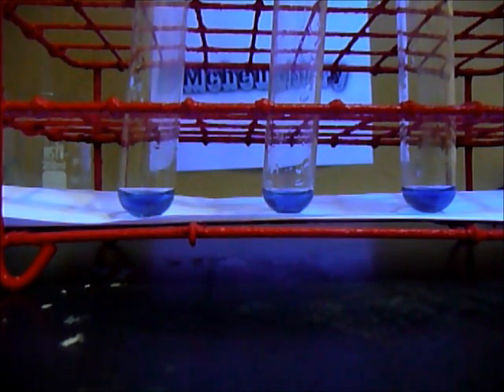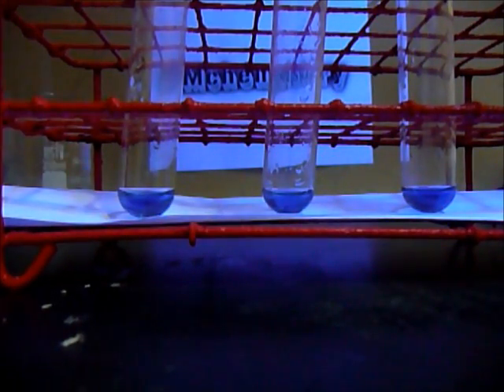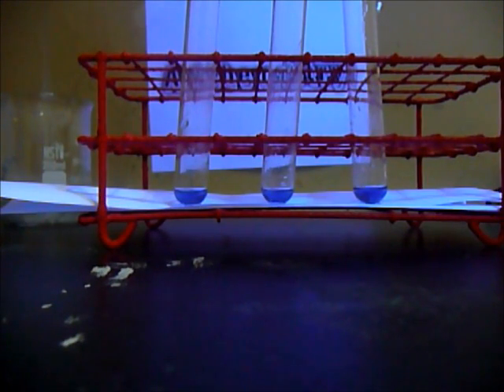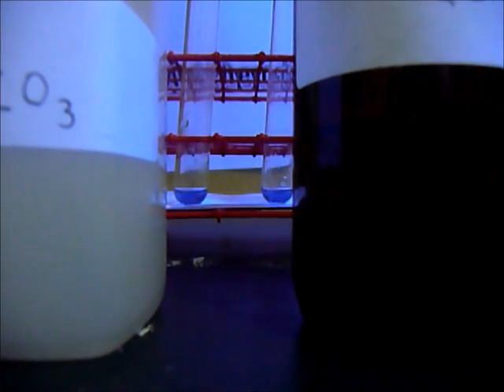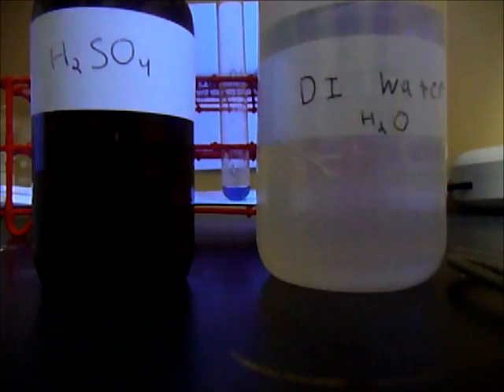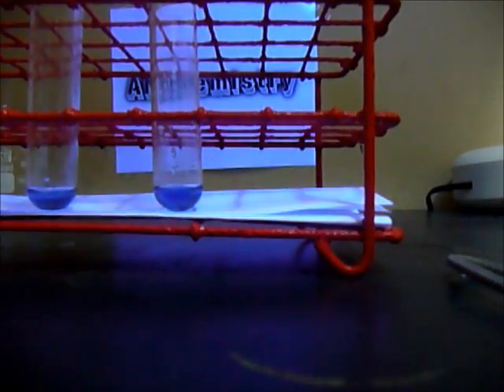Okay. So, get a neutral pH, which is just water, and a base, which I'm using sodium carbonate, and an acid, which I'm using sulfuric acid. Okay, here are the chemicals. Let me just get another pipette. And deionized water. So the next step is get 2 milliliters in each of the test tubes.